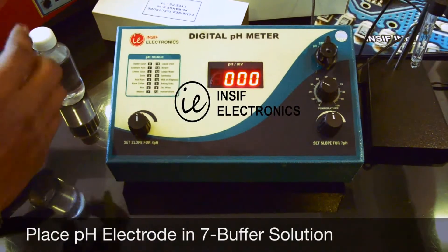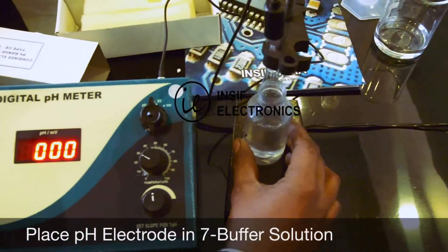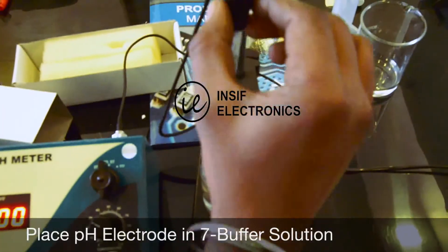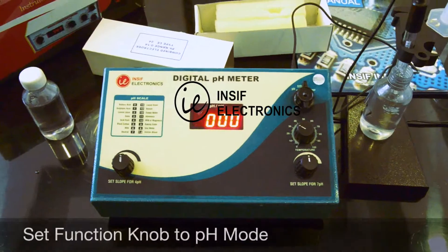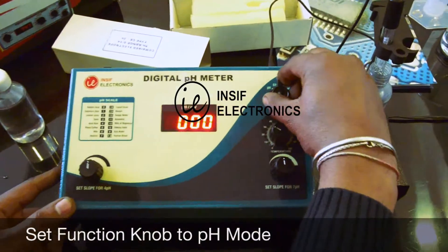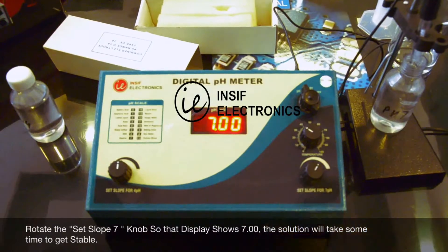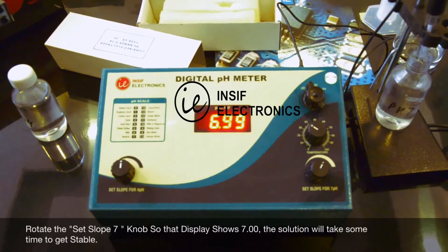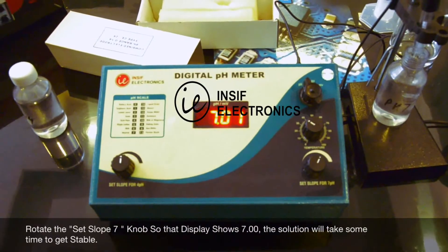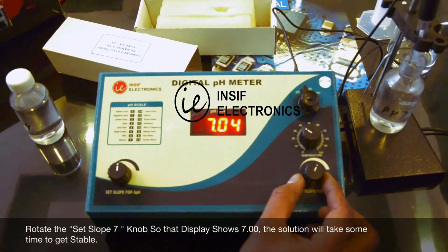Open the pH 7 buffer bottle and put it on the stand. Dip the electrode in it, then rotate the function knob to pH mode towards left and the display will show some values. Now rotate the set slope for pH 7 so that the display shows 7.00. Wait for the display to get stable, then set it back to 7.00.